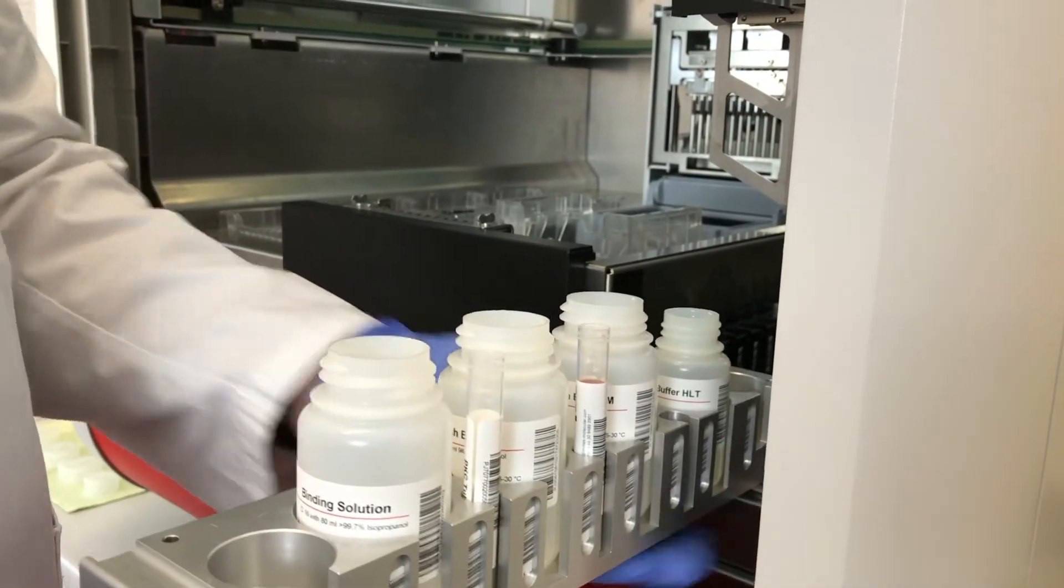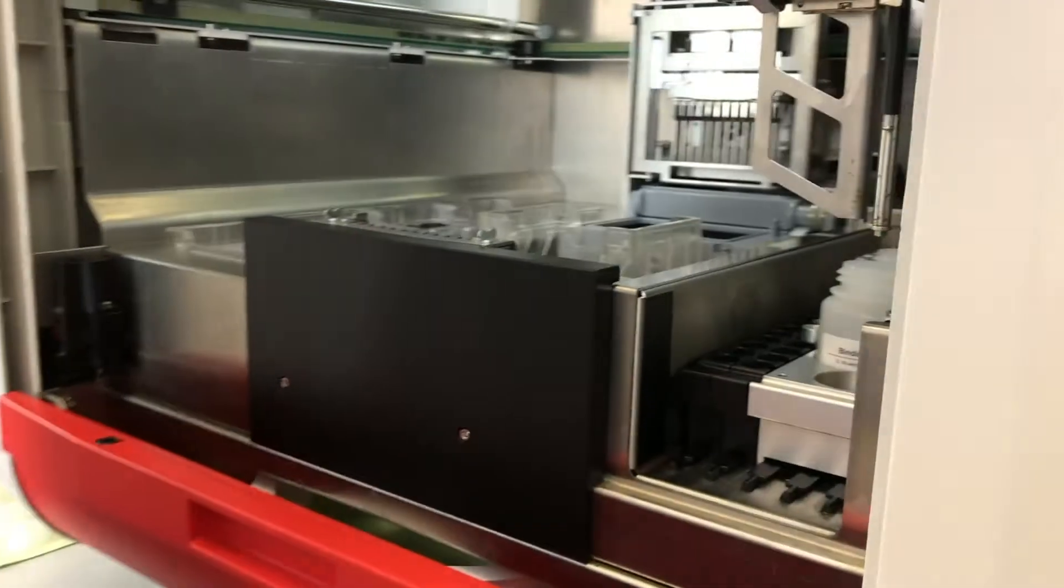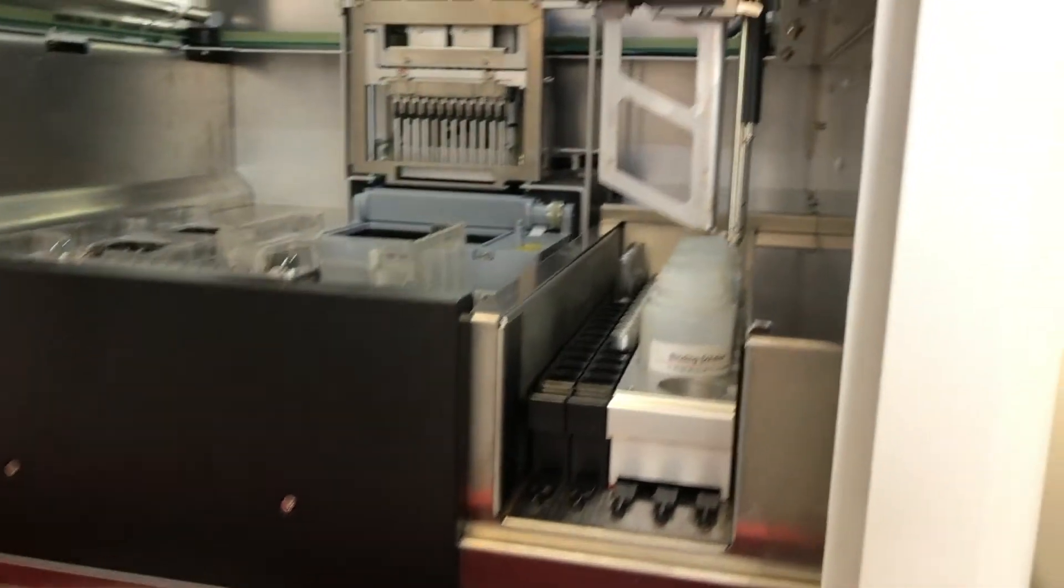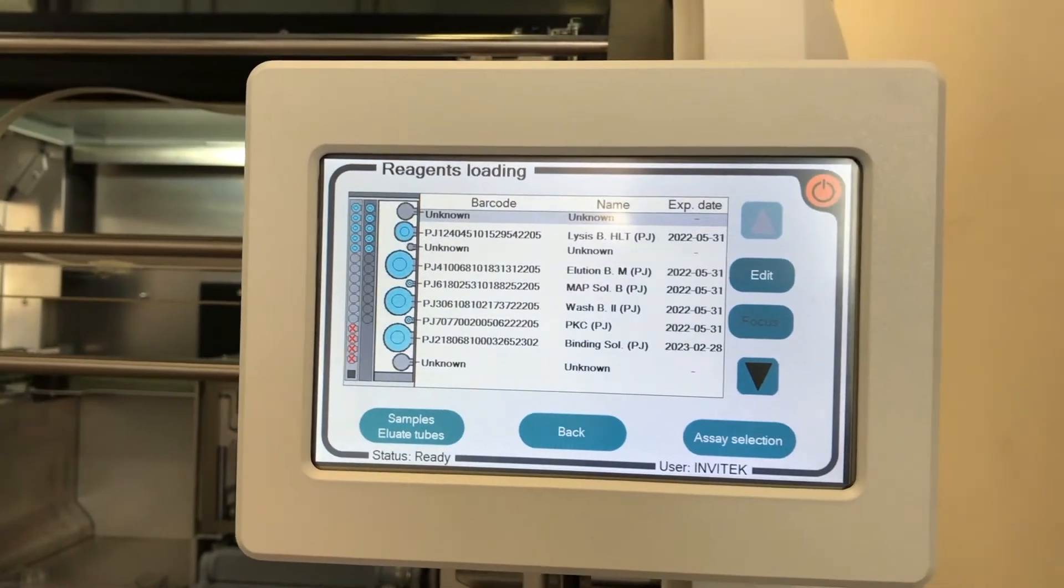When loading the tray, all compounds are detected. Reagent barcodes, names and expiry dates are displayed.